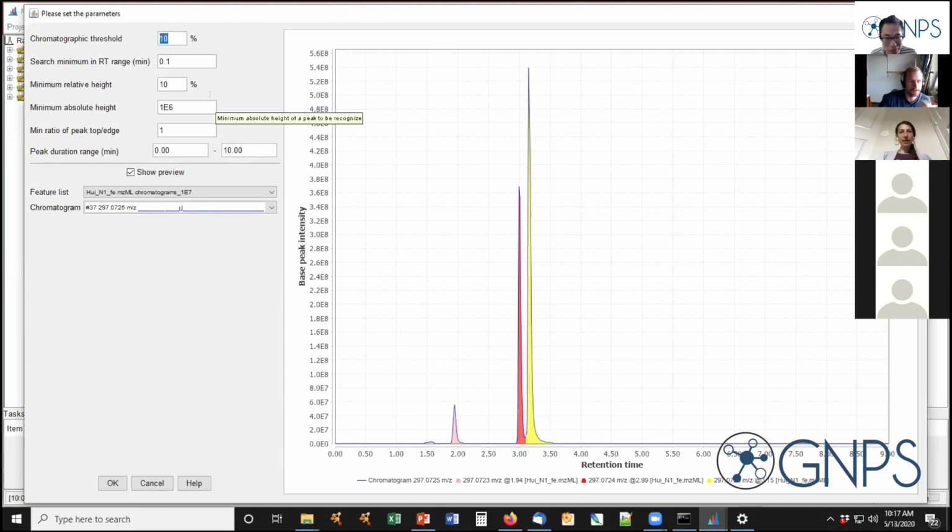A lot of people are asking for ideal thresholds and things, but as Daniel said, it's really important to look for examples like this one and see how the different thresholds work, because it'll be important to resolve each of those peaks. By playing around with the thresholds, you'll see which work the best for your data. There's not really a one size fits all, I would say.